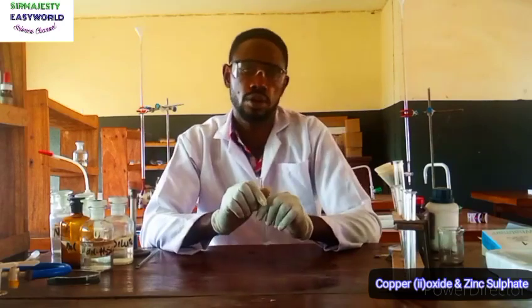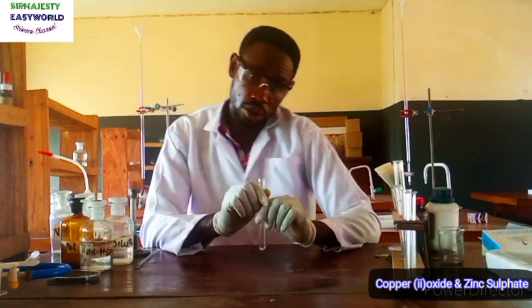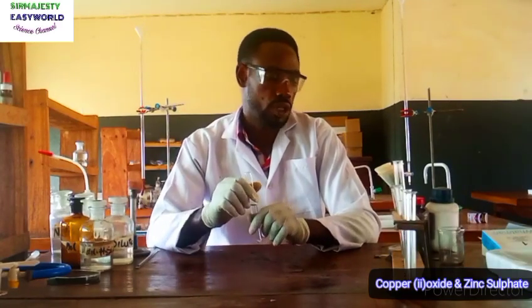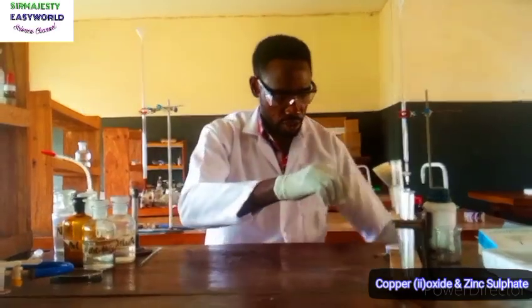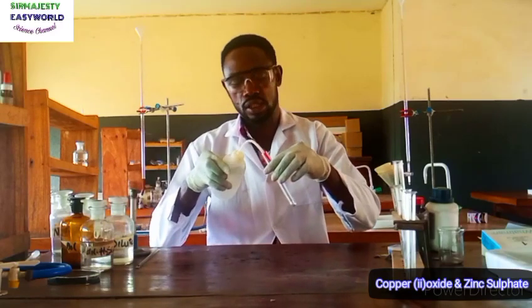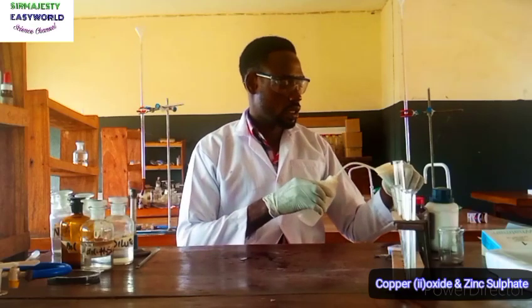saw in sodium hydroxide. So what is my observation here? I said white gelatinous precipitate formed in drops, which dissolved in excess. Maybe I repeat this experiment, this particular stage, so that you can see the gelatinous nature of the precipitate.